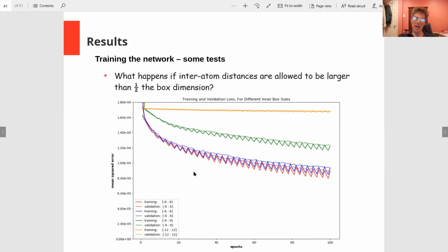And that is demonstrating that I think you need this idea of the empty space around the atoms for training, so that the network can train without that ambiguity of where the vector origins are for the Patterson map. Now, whether you can do this with real data is an open question. That hasn't been done yet.